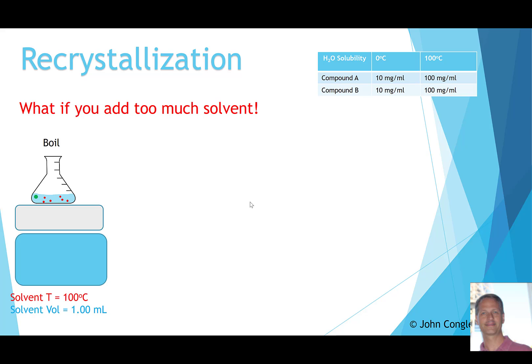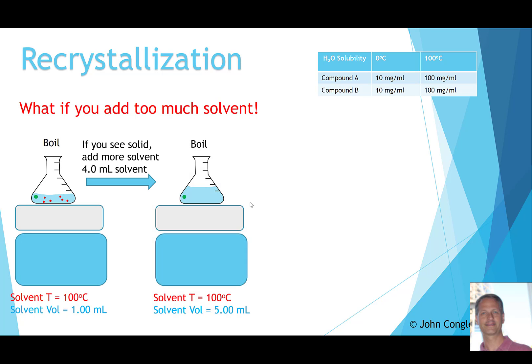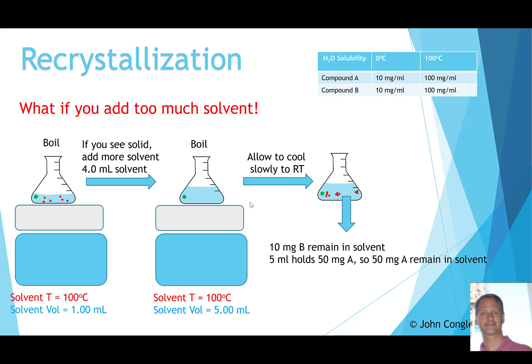What if you add too much solvent? Say you already have 1 milliliter and see a tiny crystal, so you add 4 more milliliters for a total of 5 milliliters. Everything dissolves, but when cooled to room temperature, 5 milliliters can hold 50 milligrams of A in solution. So your collected solid drops from 90 milligrams to only 50 milligrams — a significant yield loss. Adding too much solvent is a common mistake that substantially reduces your yield.